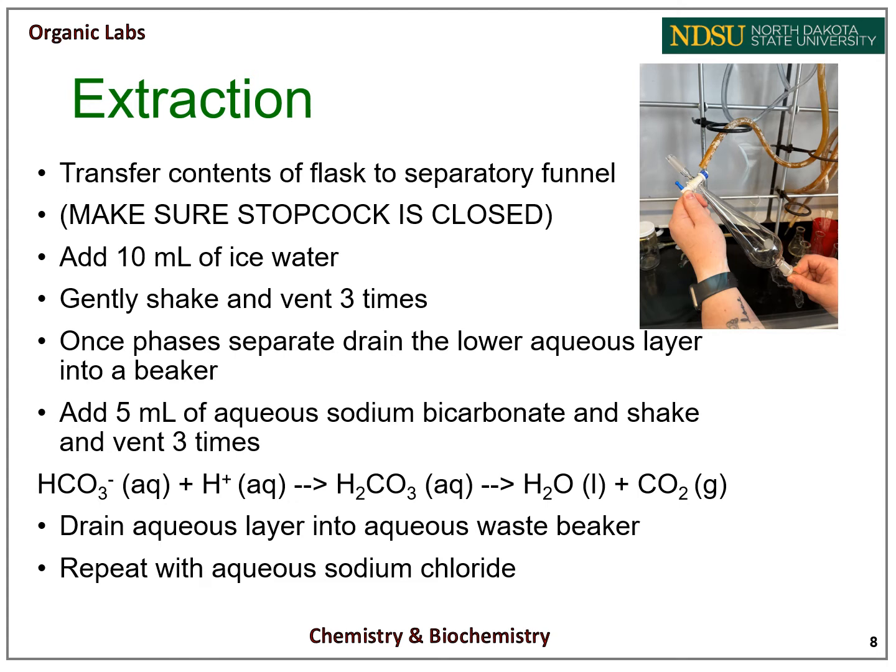Set up a ring stand and obtain a beaker. You will use a separatory funnel. Make sure the stopcock is closed, or you will lose your crude product. You will then pour your solution into the separatory funnel.